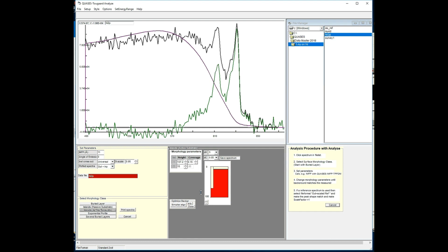The reason is that the electrons, the nickel 2p electrons excited here, go through the tall gold islands here, and we see practically nothing up here. So these don't really contribute to the spectrum in this energy range. They have lost a lot more energy on the way out, and they're further down in the spectrum, outside of the region that we're analyzing. So we only see those electrons that are excited here and go through the thin overlay. And therefore we cannot determine the coverage unless we calibrate the spectrometer.